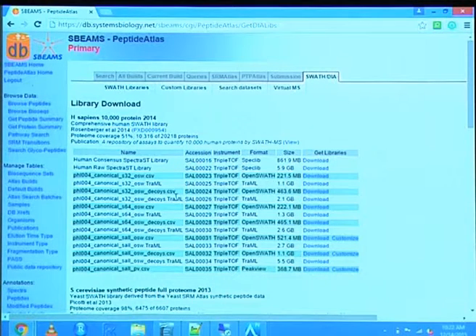This is essentially all assays, all ions, and no decoys. That's pretty much the same thing. PeakView does the filtering for you. It filters the range around the selection window. In the case of OpenSWATH, that specification about the window means these ions are excluded.